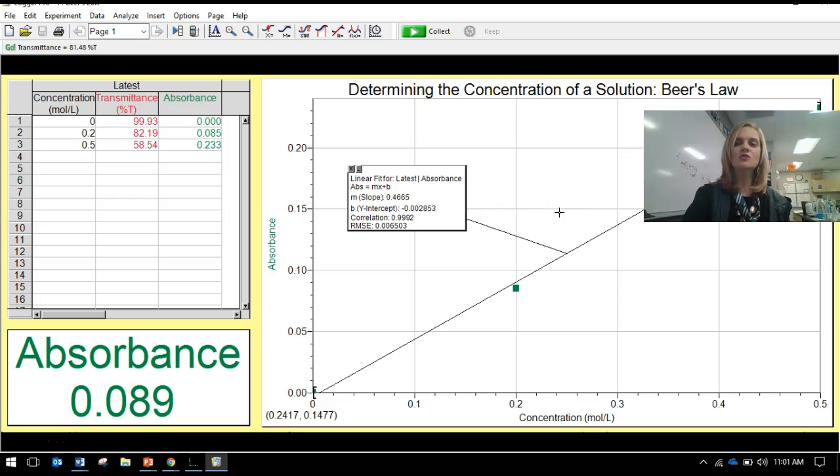I find it best to go ahead and make yourself an Excel sheet with all of the values in so that you don't have to waste time when the students come up to you. This wraps up how to do the potions lab.